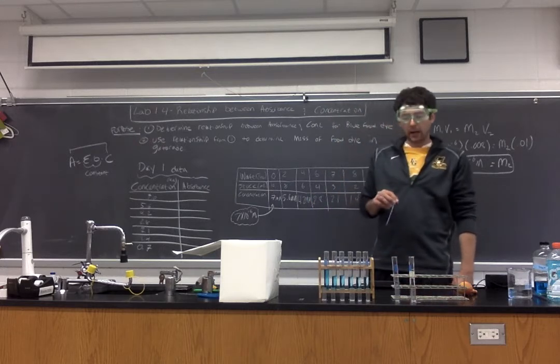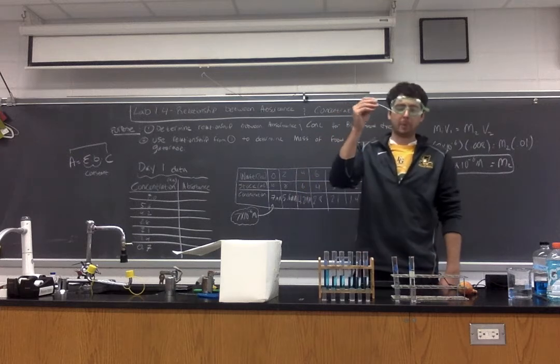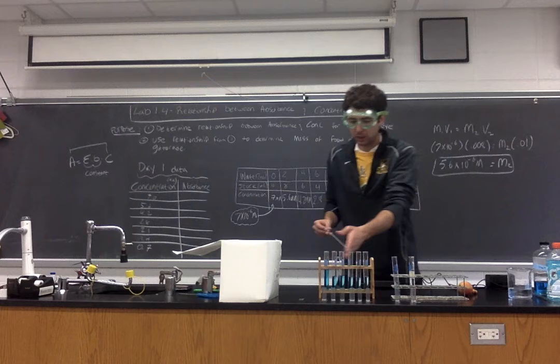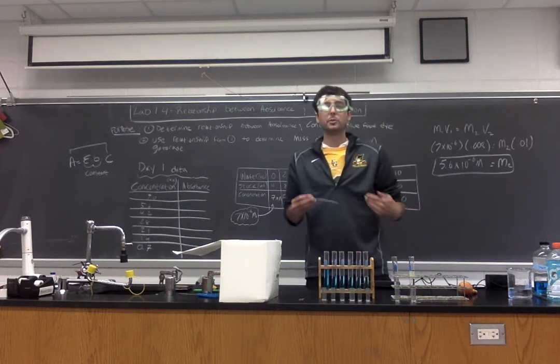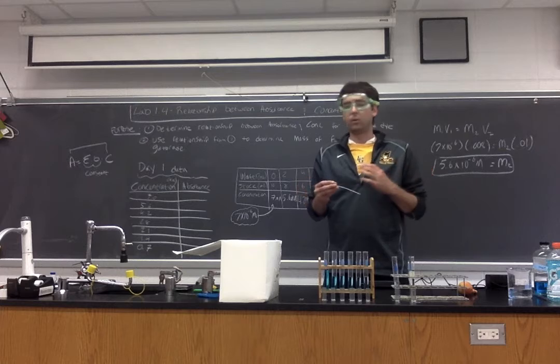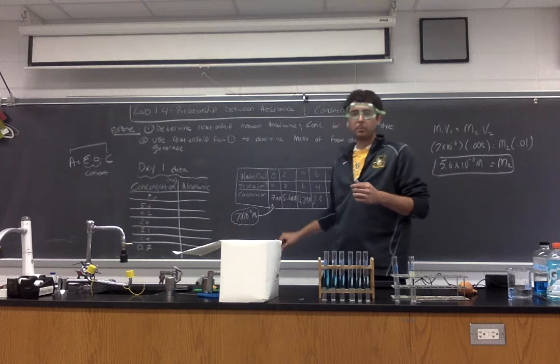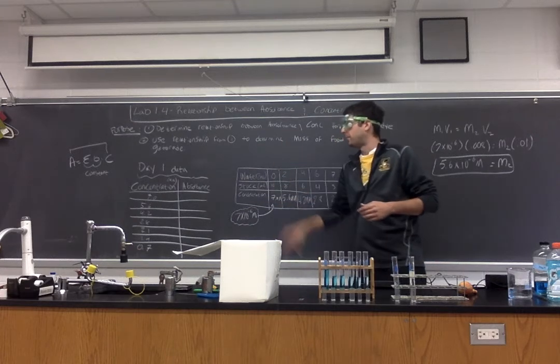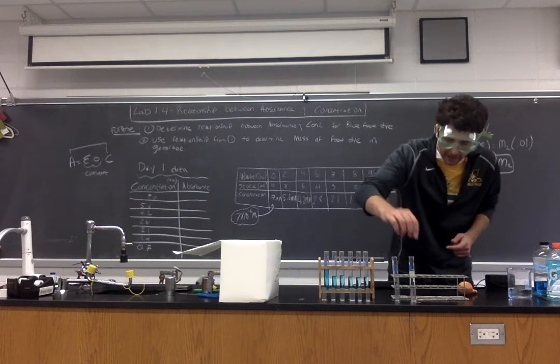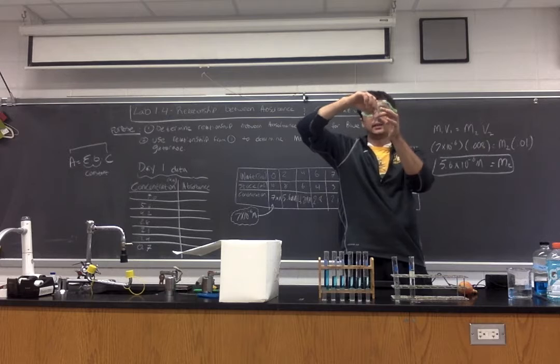Now, because we are altering the concentration on purpose, if I were to use the same pipette for each solution, I would be changing these concentrations. And remember, we spent a lot of time specifically measuring out specific volumes, so we don't want to alter the concentration. So, unfortunately, it is a bit wasteful, but we are going to have to use a new plastic pipette for each solution. So, now that I have my deionized water ready to go, I'm ready to calibrate my device.